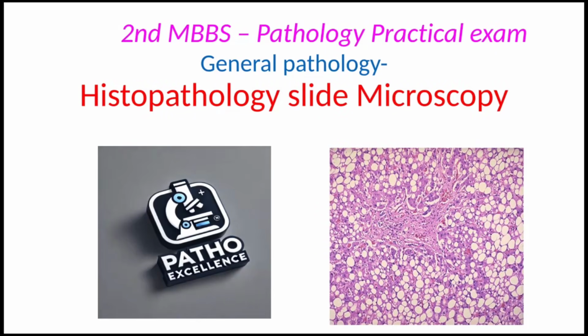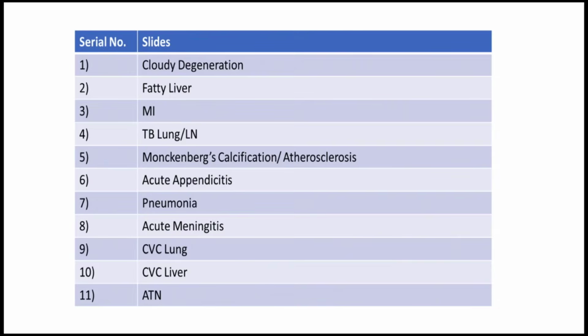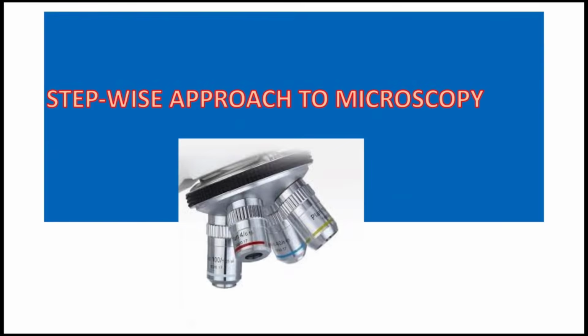Today we are going to discuss histopathology slide microscopy for general pathology, and these are some of the important slides which are important for exam. So we discuss all these slides one by one. Before we start, let's see what is the stepwise approach to microscopy.